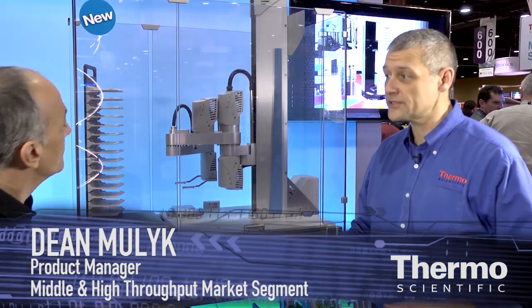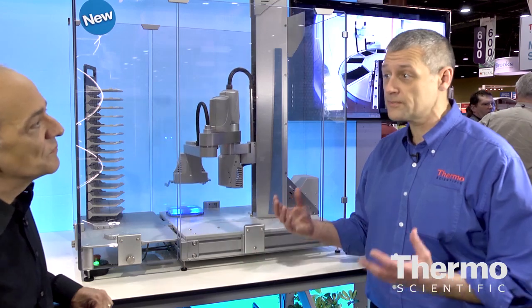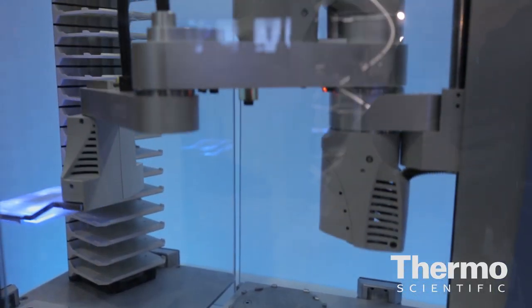This is the new ThermoScientific Valet Microplate Mover. It is a complete automation solution that incorporates both hardware, software, and integration to basically give the customer a total best user experience. It's a market leader in the technologies that we've put together here to enable them to be out-of-the-box ready to go.